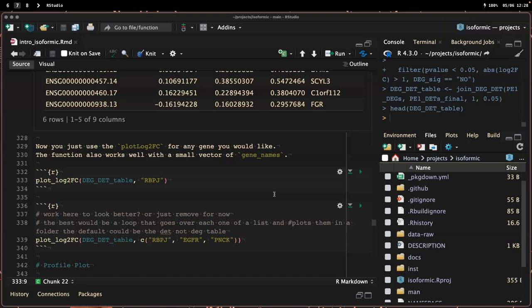That's so interesting. That's a great point, because there are multiple assumptions to the negative binomial model. One is, of course, assuming the vast majority of transcripts are non-differentially expressed. Exactly. That's a great point. I hadn't even thought about that, because I've never done that. Like, the reason I'm here is to learn your stuff. Like, I've never done this on bulk before.